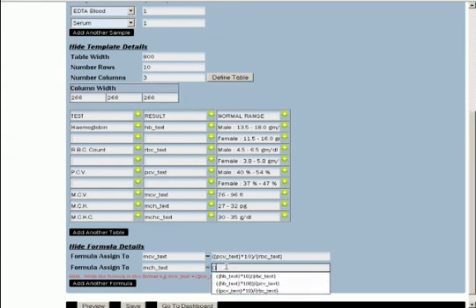Let's look at it up close and personal. For example, the MCH value, which has to be displayed in the cell marked as MCH underscore text, is equal to HB underscore text into 10, and we would wish that it is divided by the RBC count.